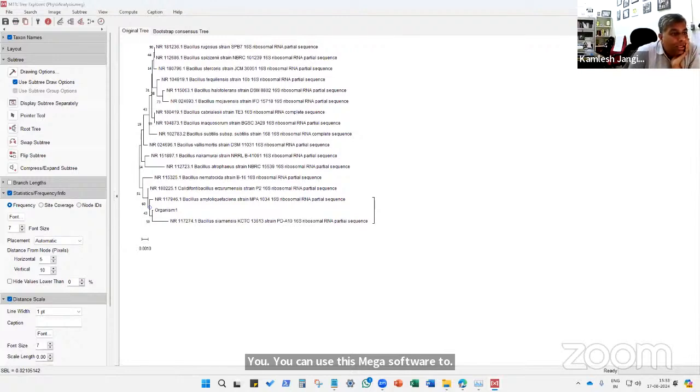All right. Now, the next question is: sir, what if we get two different strains or organisms using Mega software and Easy BioCloud? Which one would be preferred as selectable and why? So, I would always rely on my phylogenetic analysis first. But before I blindly rely on it, I would like to cross-check my data.